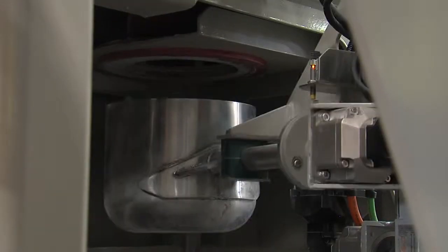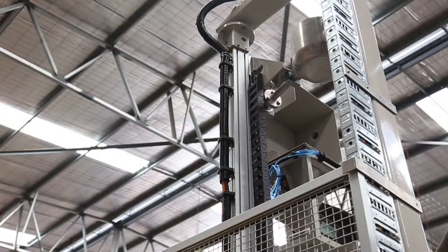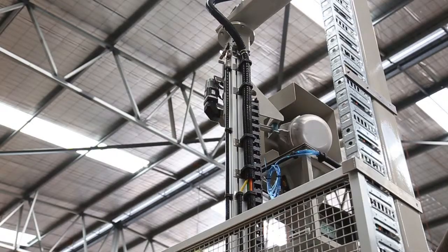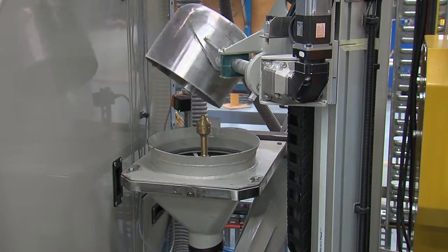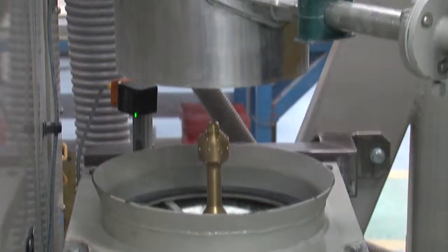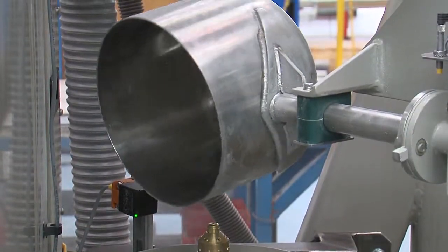A robust bucket lifter moves the samples from the crusher to the rotary tube sampler. All major equipment items are at ground level for easy maintenance. The bucket lifting system includes an air blast cleaning station with dust extraction point to keep the bucket free of residual sample material.